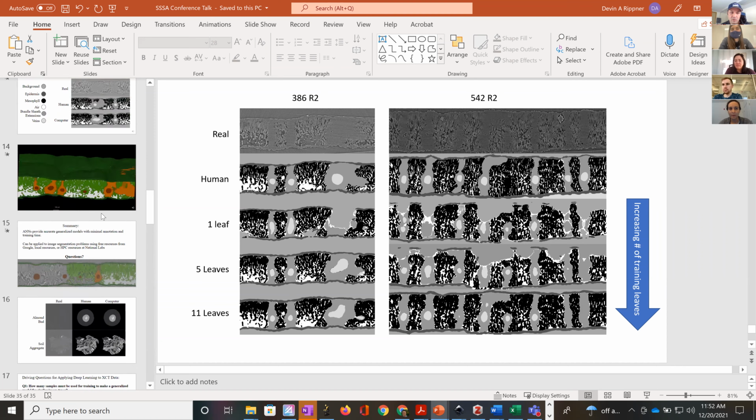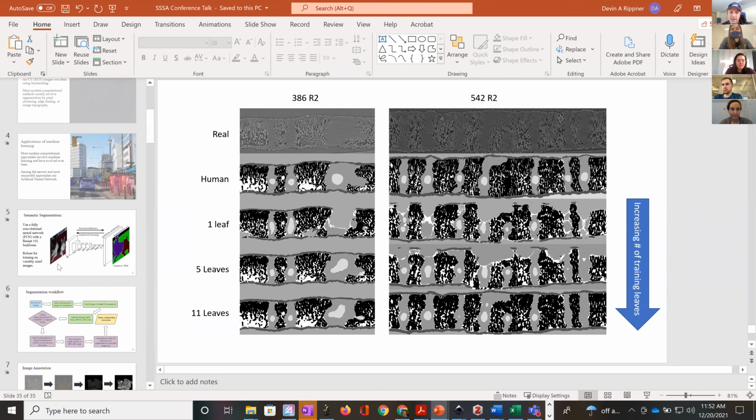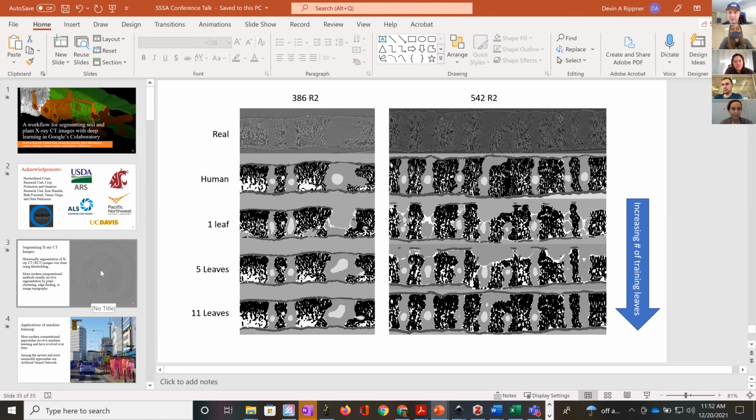So I'll just share the code with you, and I can make multiple folders. Once I share the code, you guys can just make your folders and everything. It's pretty straightforward. How comfortable are you all with Python? Okay. How about coding in general? You all use R, right? Okay, that's good. I barely use R. I should use it more. But if you're just comfortable connecting folders, then it's easy.